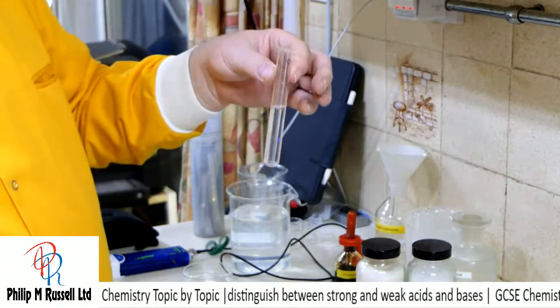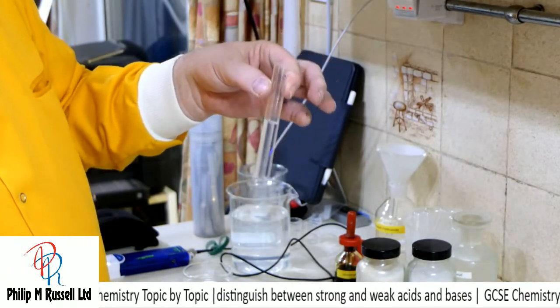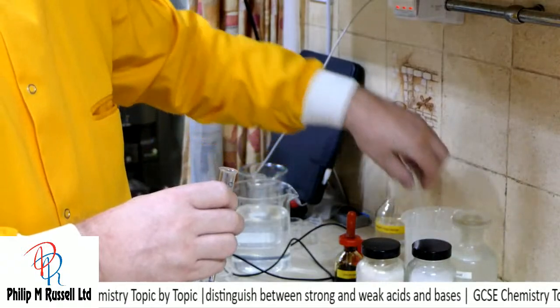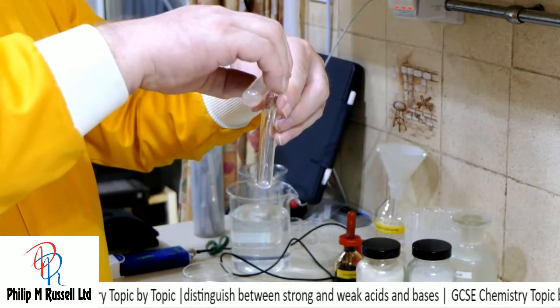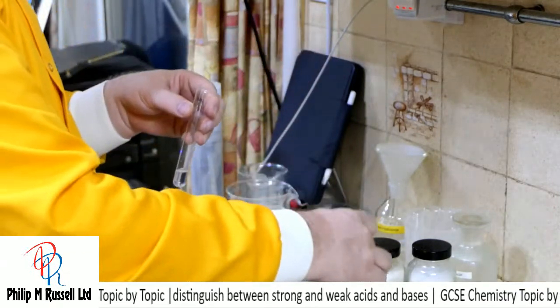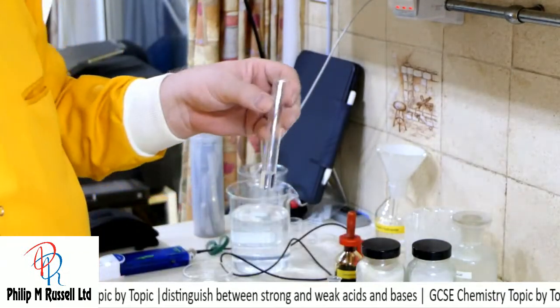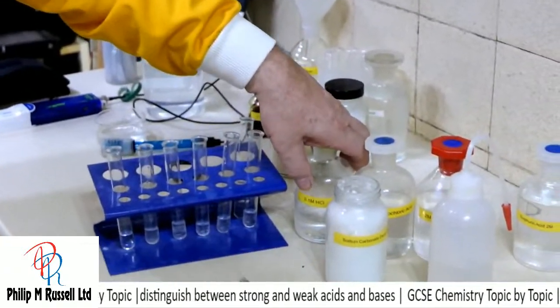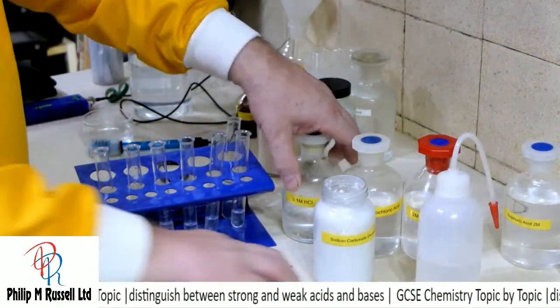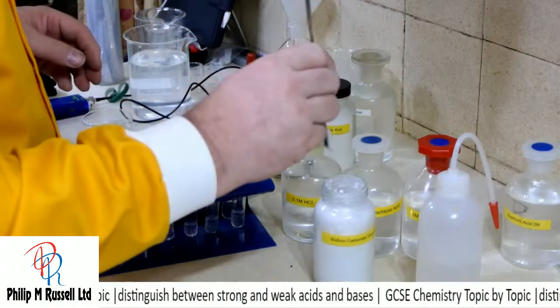I could have done this with a measuring cylinder, but I'm just trying to give you an idea. And let's put in the same amount. So this is now not 0.1 molar, but 0.01 molar, approximately.